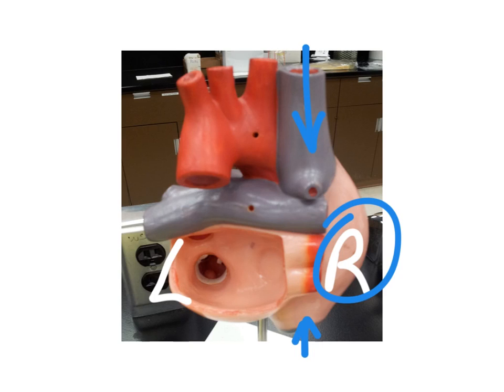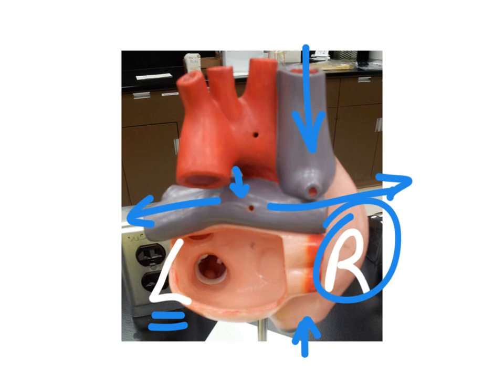I also want to point out that this is the posterior view, so the pulmonary trunk would have come to the dorsal side and then branches into left and right pulmonary arteries. Remembering that this is a dorsal view, so the left and right have now switched — this would be the right pulmonary artery and this is the left pulmonary artery.